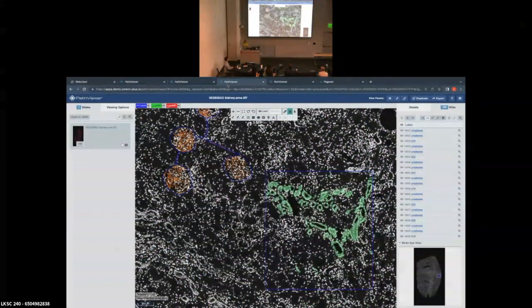I have some data from NanoString, and a gold star to NanoString. They write an OME TIFF, which is one of these open standards for file formats. And they also have really lovely mask and other ROI data in that OME TIFF itself. If you import this directly into OMERO, we didn't do any pre-processing or post-processing of this data, and you can see you have an image with a mask already overlaid. Quite nice that they already write their data in this open standard that's easily ingestible by the platform. You can see those orange and green masks there from, this is GeoMx data.